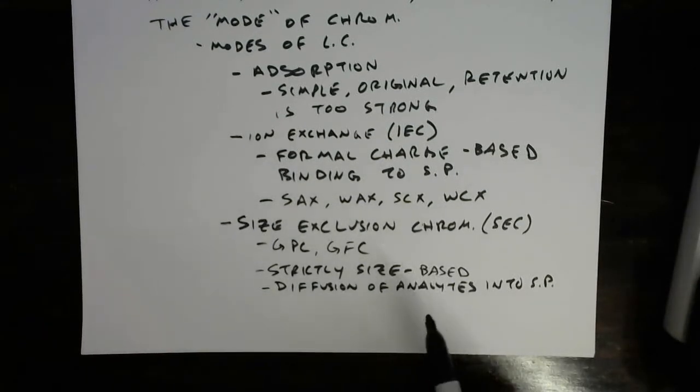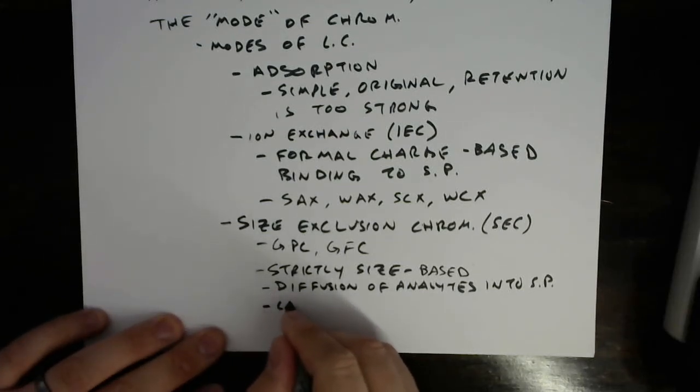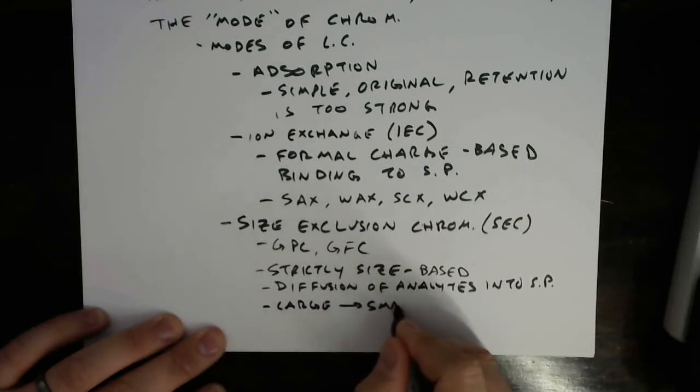And so naturally smaller molecules can diffuse more and deeper into each pore, and so they are retained longer. The retention order here is from large to small. So small things come off last.